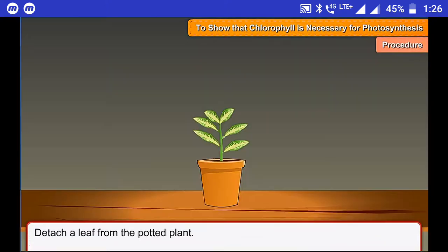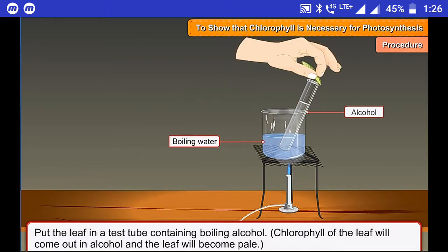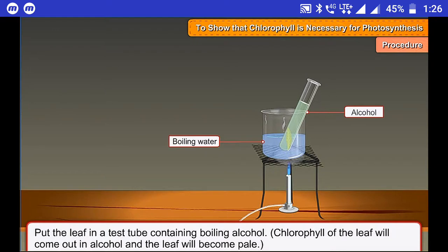Method: Detach a leaf from the potted plant. Put the leaf in a test tube containing boiling alcohol. Chlorophyll of the leaf will come out in alcohol and the leaf will become pale.